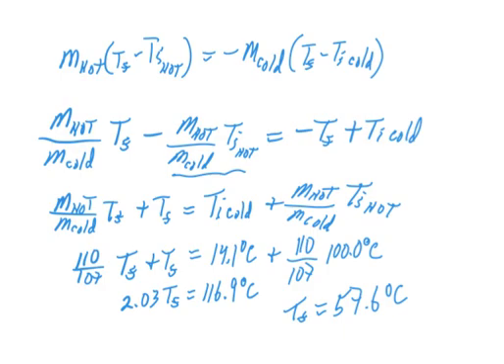So try this at home, use different amounts of material, see if you can get close to the theoretical value in an experiment of yours, and share your results with me.